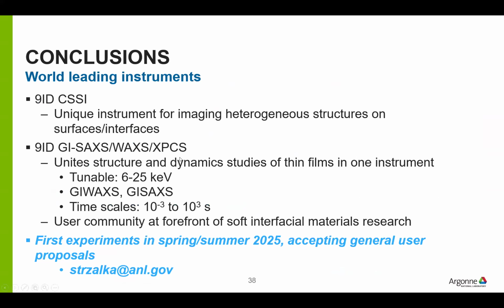And also the other half of the time will be spent on grazing-incidence SAXS, WAXS, and XPCS. And so we're excited to be able to unite both studies of structures and dynamics on one instrument, and we hope that will lead to good synergies and new directions for research.